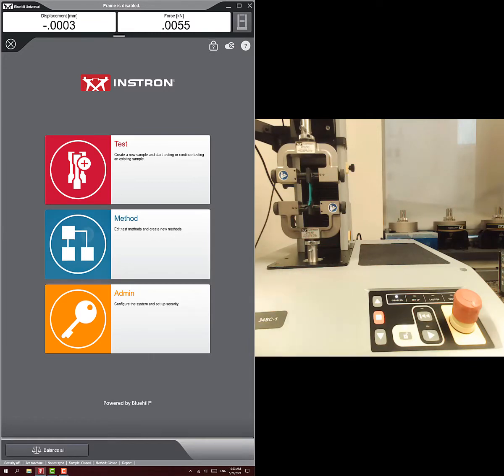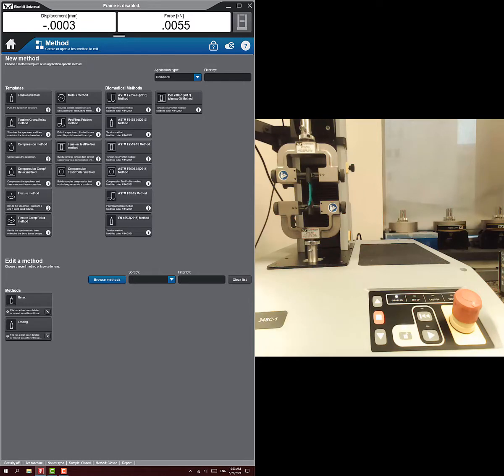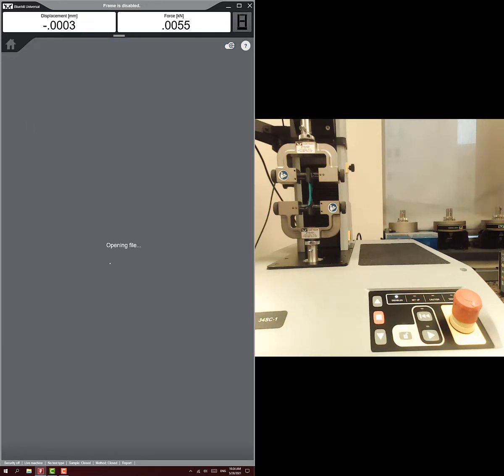For this one, we'll start with a stress relaxation. Fortunately, there's already a template method that lets us do stress relaxation, and it's called the tension creep relax method. And so that's what we're going to choose.